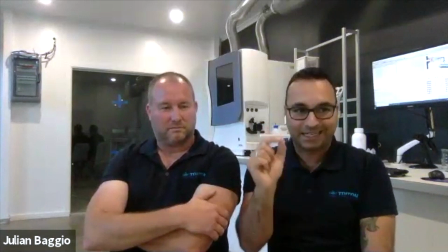But what you had before is you put it in and you hope you do everything right. And you can see whether your coral is dead or not. That's not enough. That's not the measurement. The measurement is not the coral. So ICP is exactly in between that. You see, oh, my copper is creeping up, and my copper is at 10. It's not deadly yet. It reaches 20, it gets deadly. You see a yellow zone, and you know you need to do something. The computer will tell you, and it's before your coral is dead, before your famous 1 meter Acropora dies.